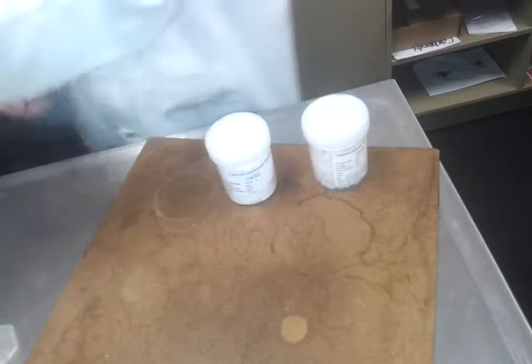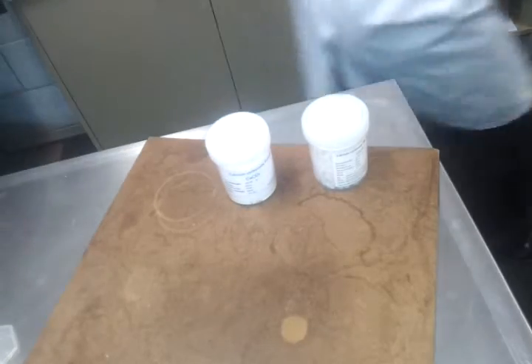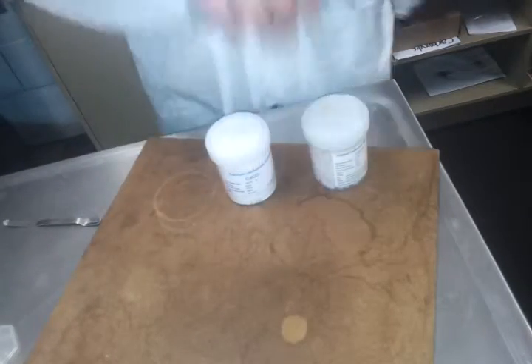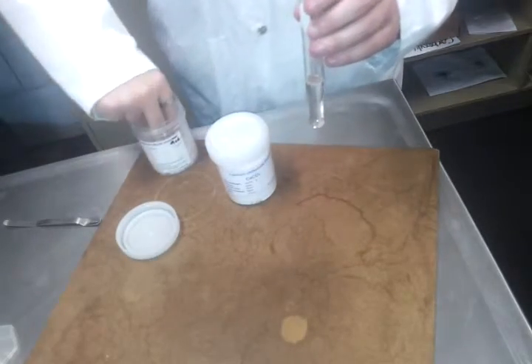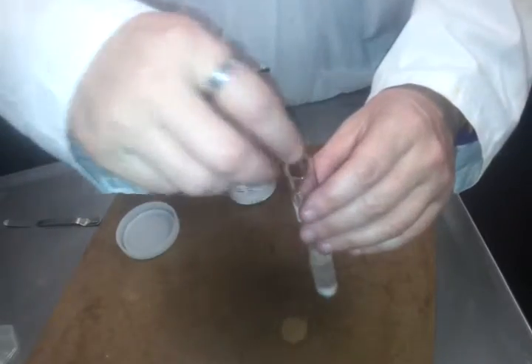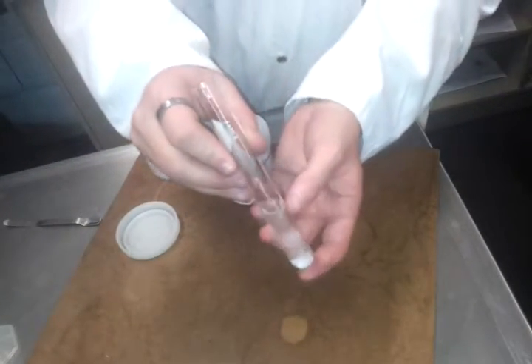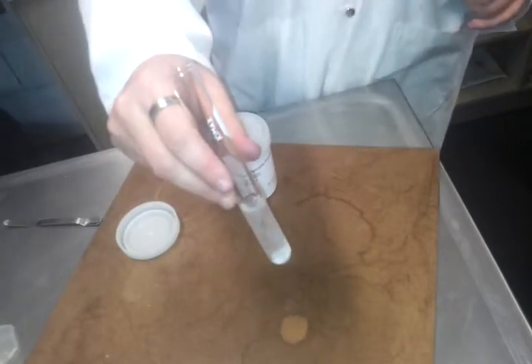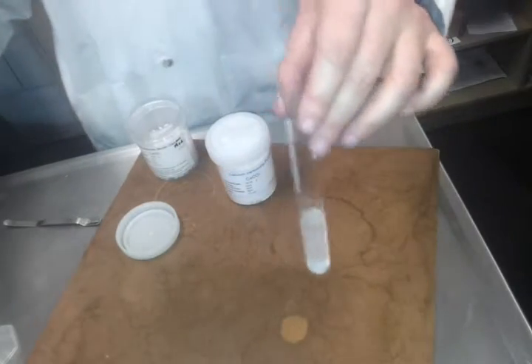So I'm going to put some hydrochloric acid in each test tube, and now we're going to have a look at what happens when we put some marble chips in there. And we can see that it starts to bubble, which is a sign of a reaction occurring. Okay, and if we were to test that gas, we would find that it's carbon dioxide. So we've got that reaction happening there.